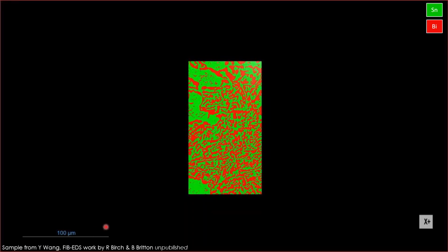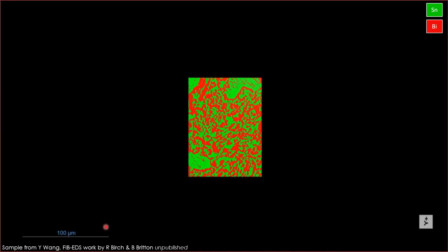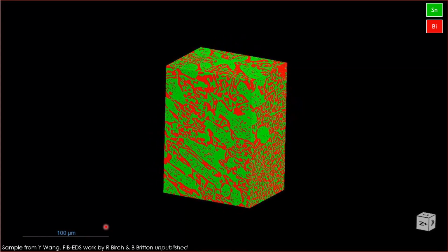And of course, this data set is quite big. These micrographs are quite large for this tomographic data set, with extremely high contrast and very good segmentation. And so we can see and imagine the power of this approach. This was showing you that we can do it with EDS. Of course, the contrast from the backscatter is very nice as well, so bear that in mind.